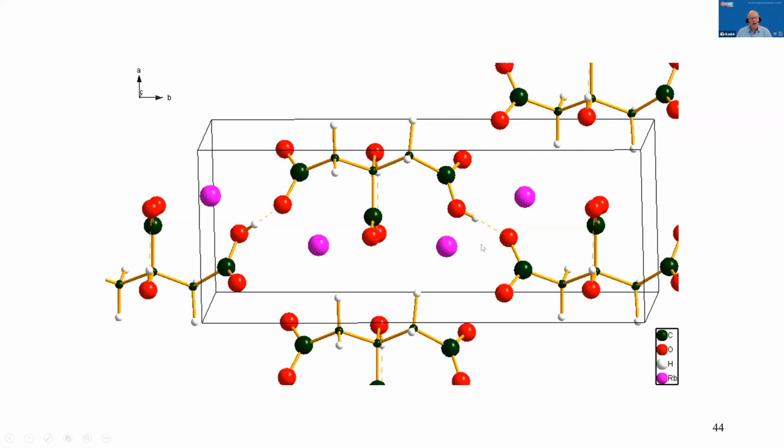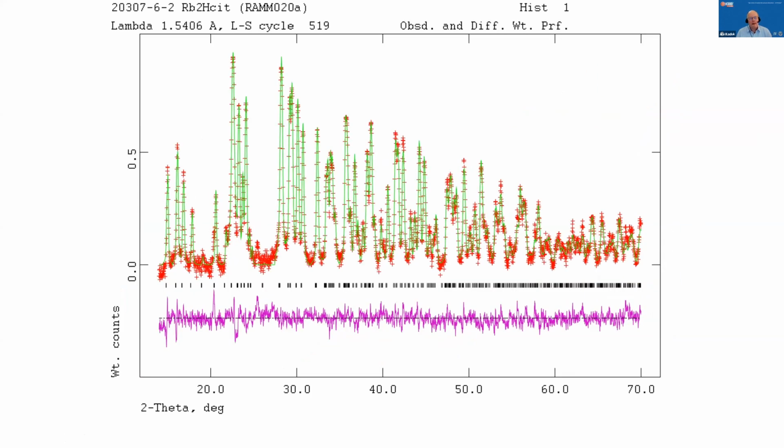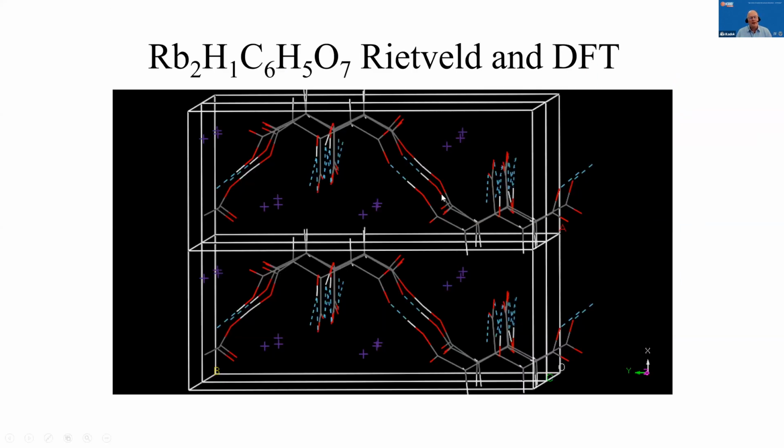It was very easy to tell roughly where it was. And then got a really good refinement, and then did the quantum mechanics, which agrees very well. We got 2 structures overlaid, and the quantum mechanics decided it was over here. I just put it halfway in between to start the refinement. Let the DFT move that around.